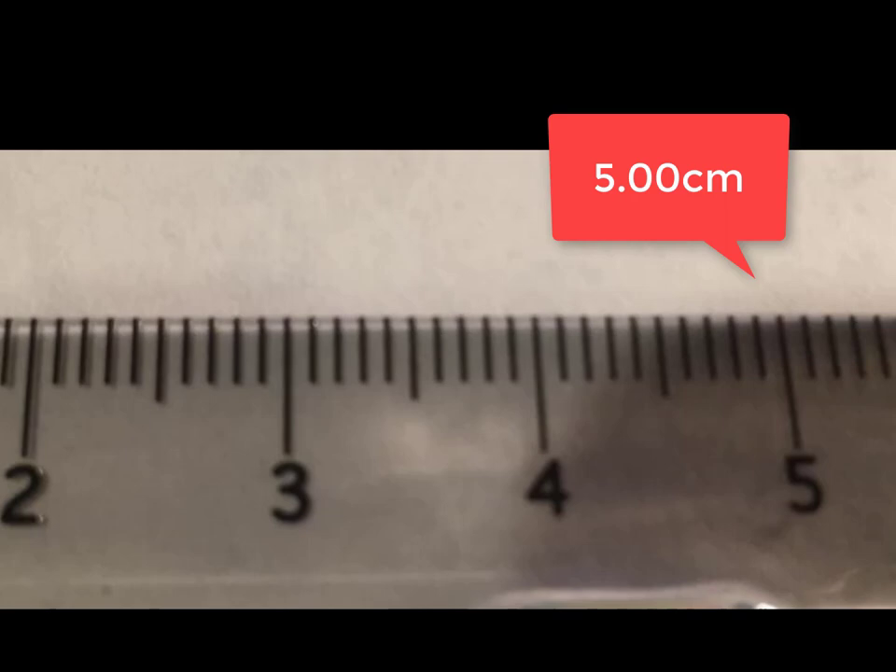Record all digits out to the correct place to communicate the accuracy. In the case of the thermometer, as we count — for example, from 20 to 30 — the ones place is being incremented. So the graduations are down to the ones place in this case. Therefore, we could estimate to the tenths place. The temperature shown in this picture could be recorded as 20.9.